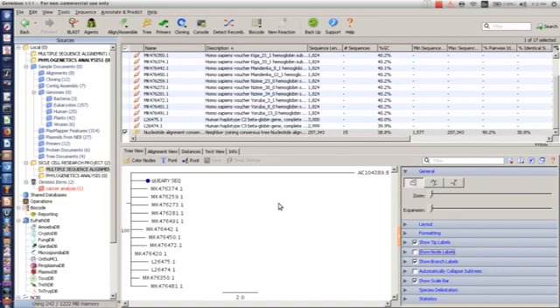So now the essence of this is that all these are similar, and because this is actually the root, that means they all have the same ancestor. They all have the same ancestor, as you can see now. So they all have the same evolutionary similarities. That's the essence of this now.